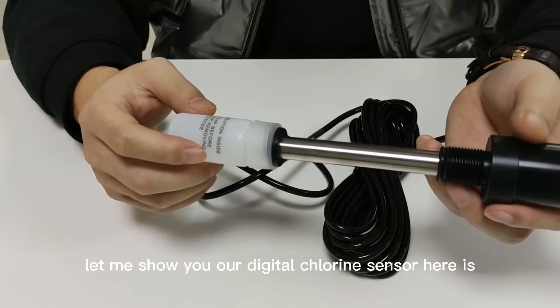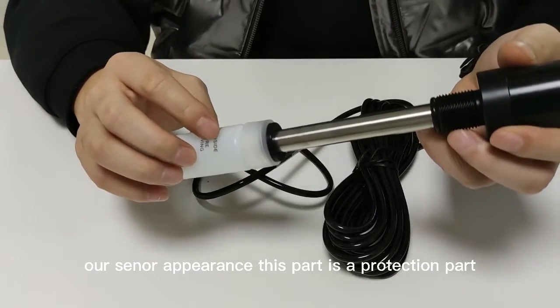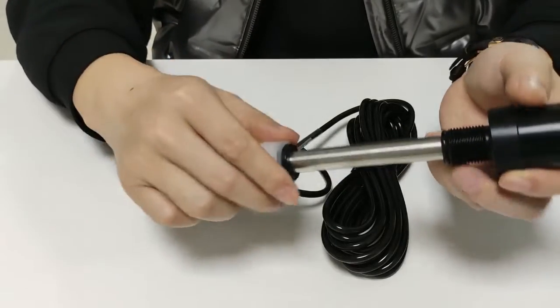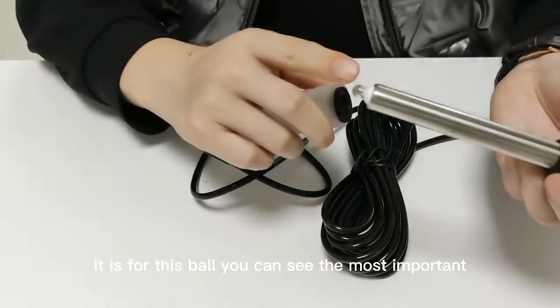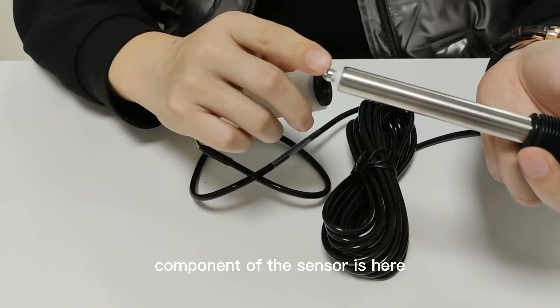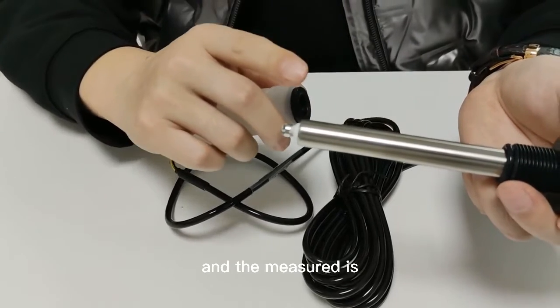Let me show you our digital chlorine sensor. Here is our sensor appearance. This part is a protection part — it is for this bulb. You can say the most important component of the sensor is here.